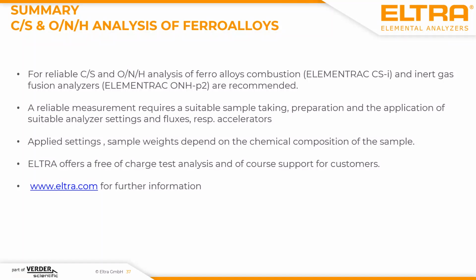Nevertheless, when you get, for example, trouble with the correct analysis of ferroalloys, keep in mind that ferroalloy could mean something totally different. A ferroalloy with 10% of titanium is very different in comparison to a ferroalloy with 90% of titanium. This could mean that you need different settings, different flux material, and a completely different application. For a complete, correct analysis of ferroalloys, always consider not only the analysis steps, but also the sample taking and the sample preparation process.